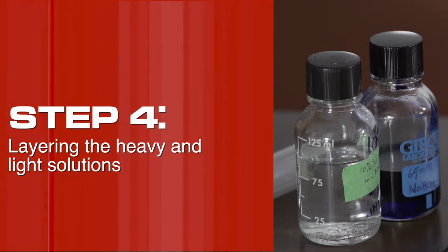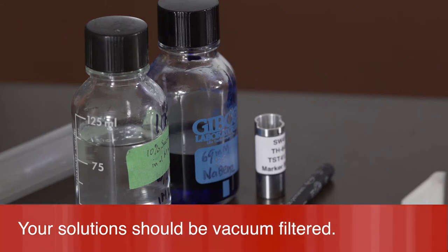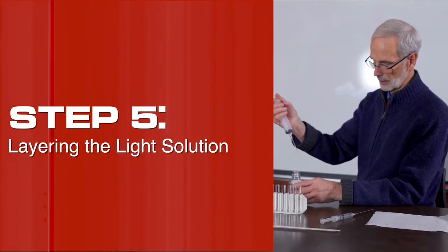Step 4: Layering the heavy and light solutions. Note that the dye in the heavy solution is for demonstration purposes only. Your solutions should be vacuum filtered. Step 5: Layering the light solution.